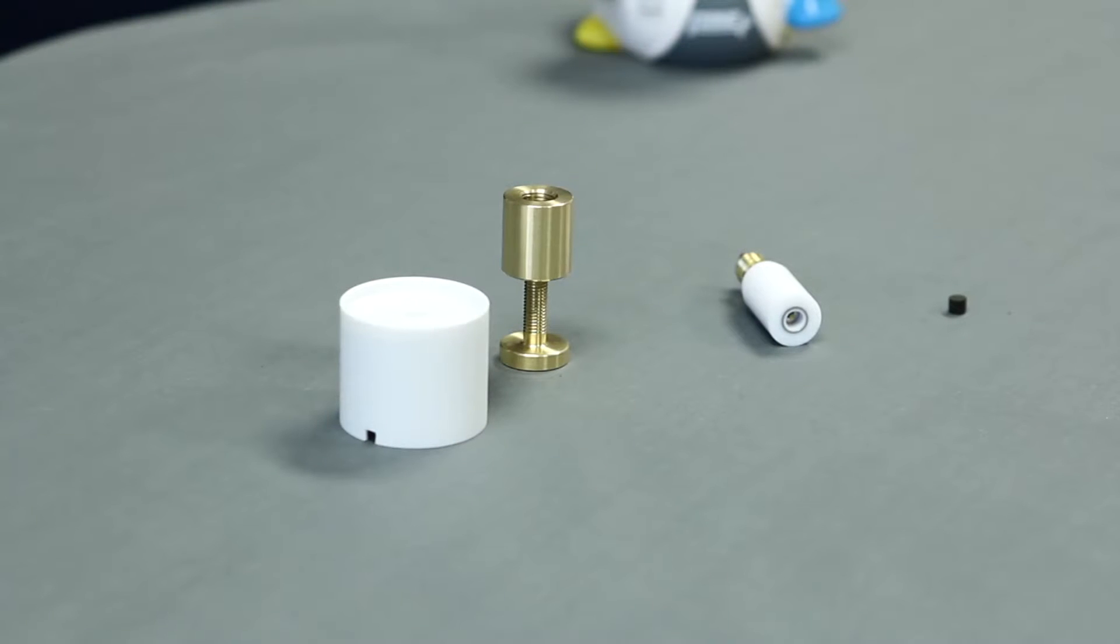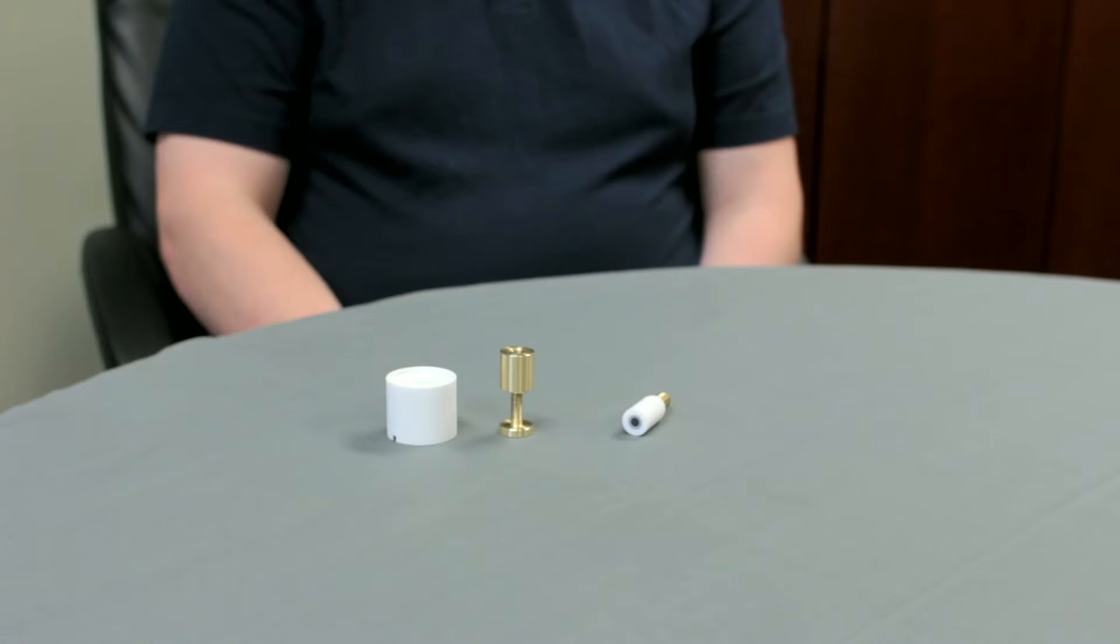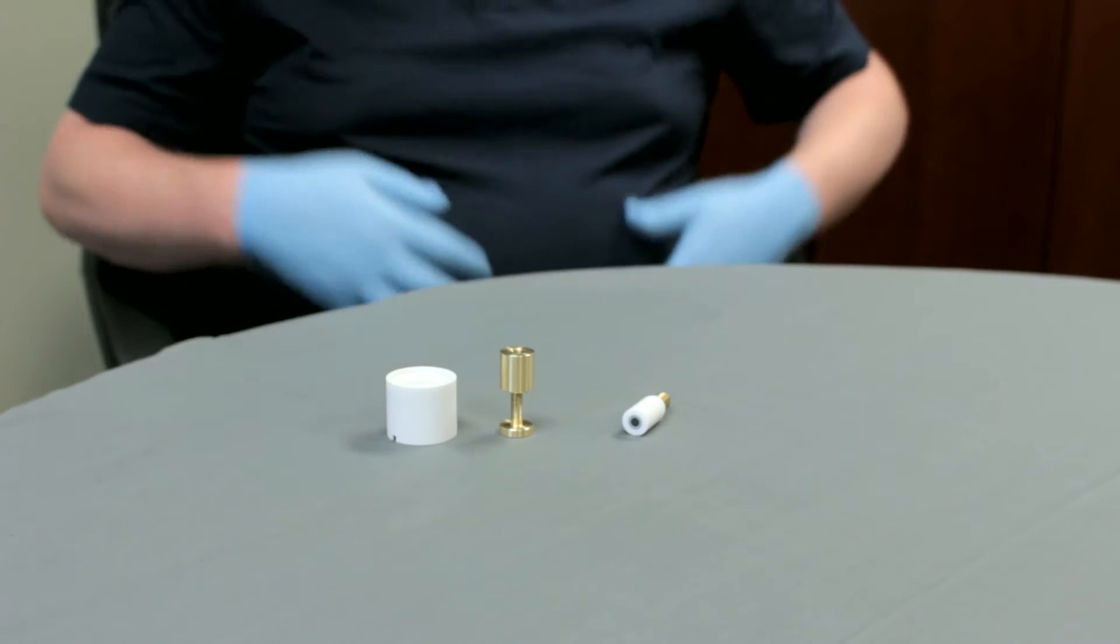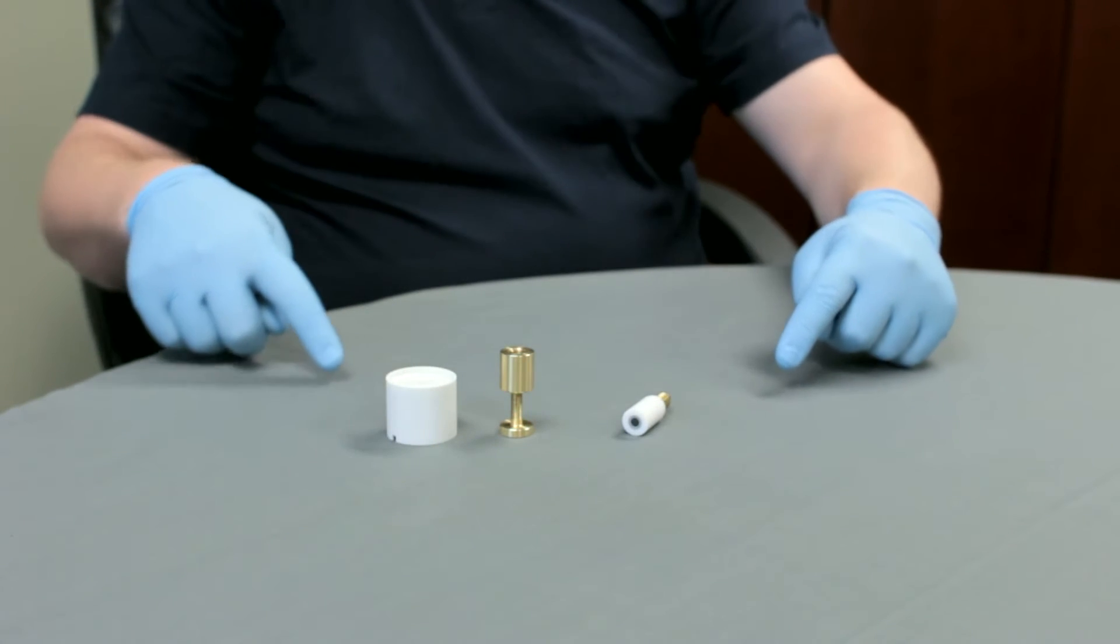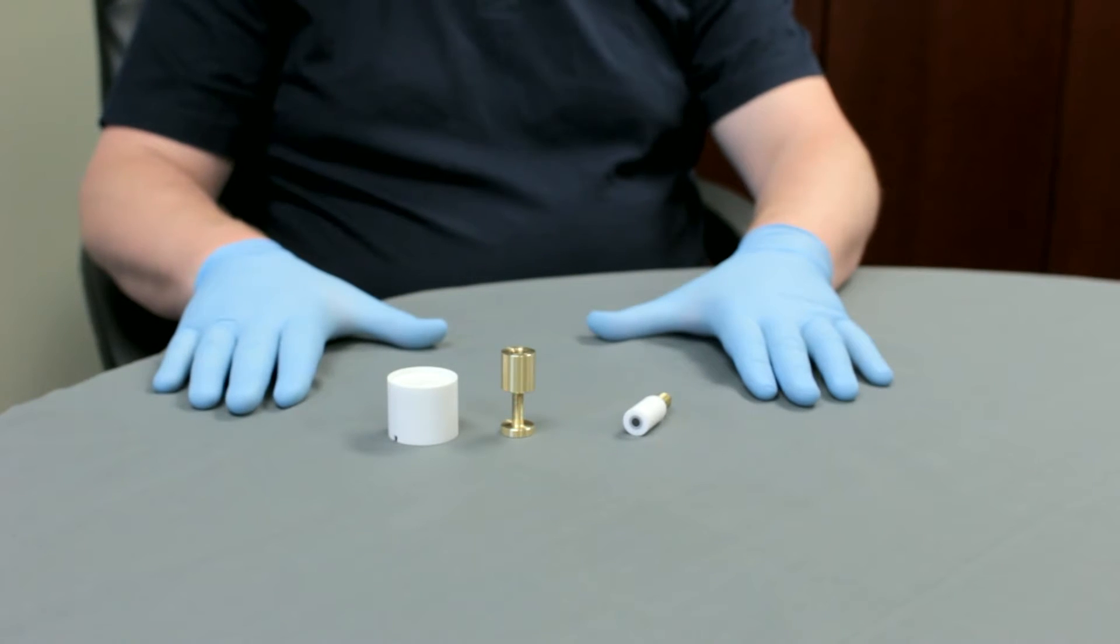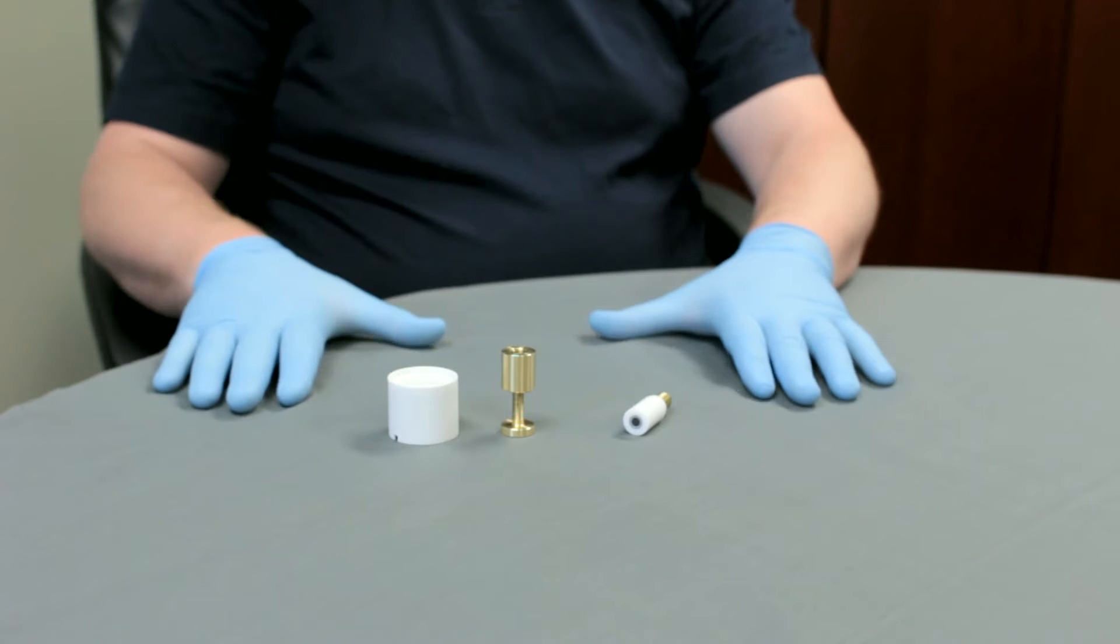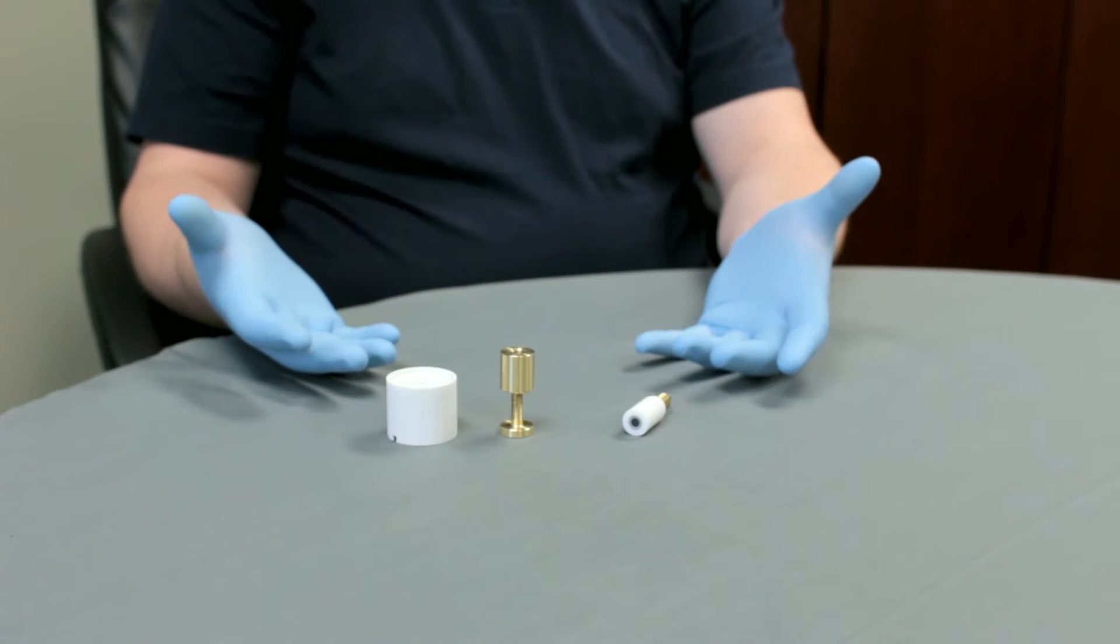For this video, we will be using the E6 series RRDE tip. Before assembling or disassembling a change disk RDE or RRDE tip, a clean surface should be prepared, with a shallow guard around the working area to prevent accidental loss of components during disassembling or reassembling. Gloves should be worn to minimize contamination to the electrode or component surface.